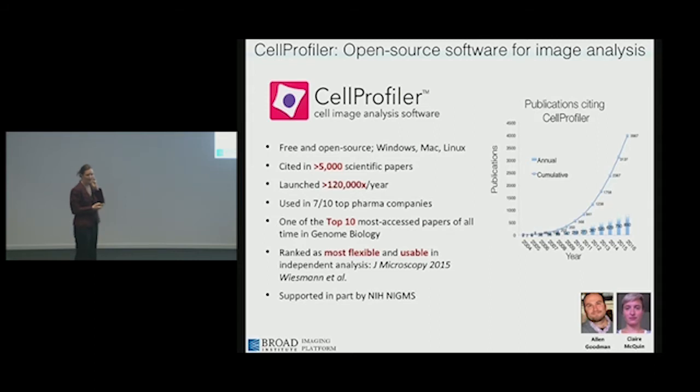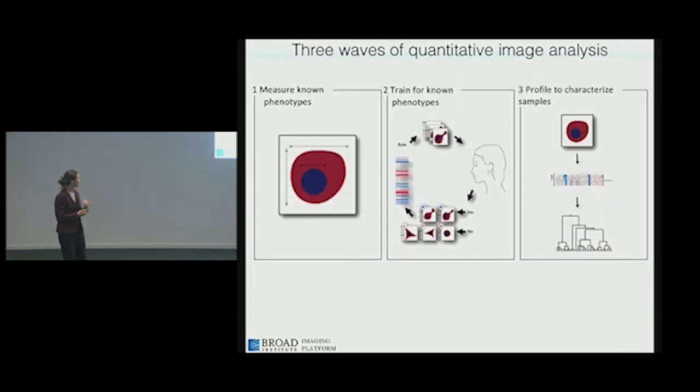If you've heard of my lab, it might be because of CellProfiler. That's the open source software project that we lead. It's used by thousands of biologists, and I'm not going to talk much about the software itself, but I will say that next week we have CellProfiler 3.0 coming out after a couple of years of development, and it has 3D capabilities. And I'll mention that a bit.